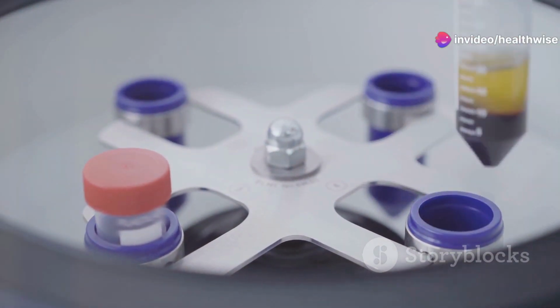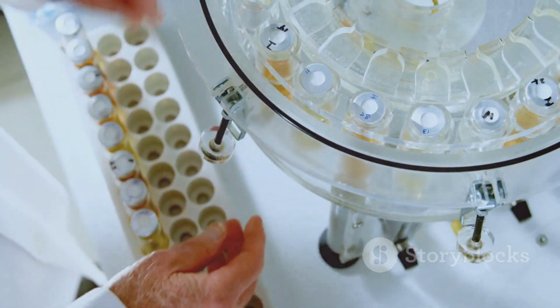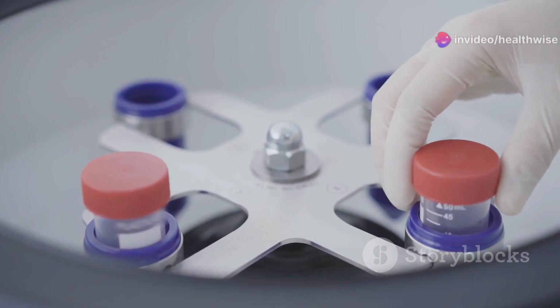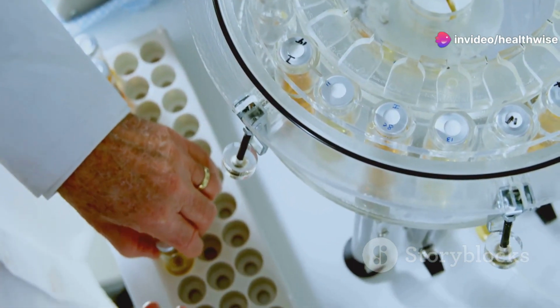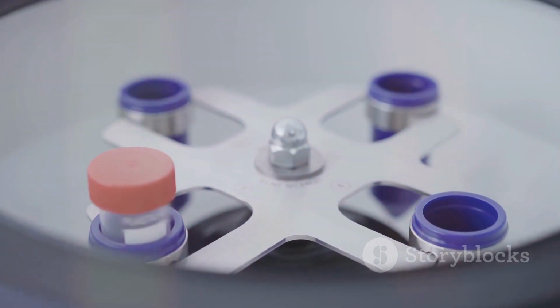5. Wait for it to stop. Never try to open the lid or stop the rotor manually while the centrifuge is running. Wait until it comes to a complete stop on its own. 6. Collect your samples. Once the centrifuge has stopped spinning, carefully remove your sample tubes. You should see the separated layers of your sample, ready for further analysis.